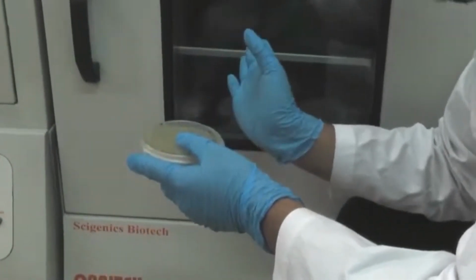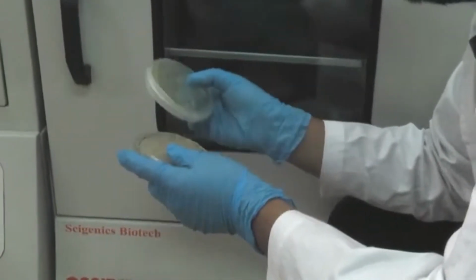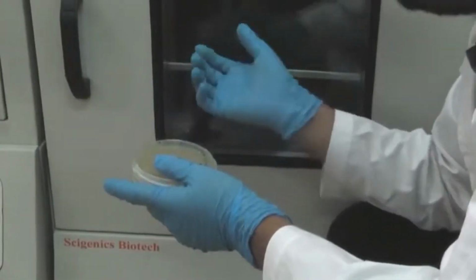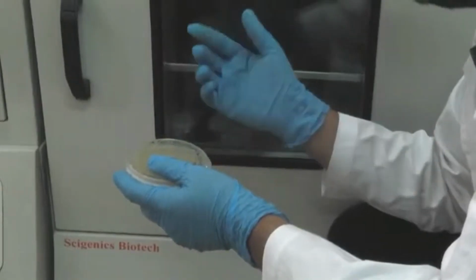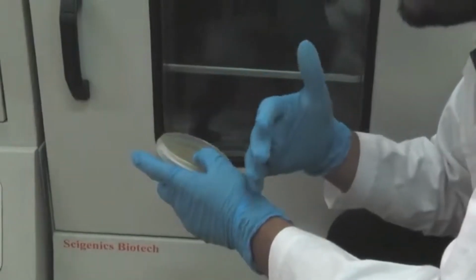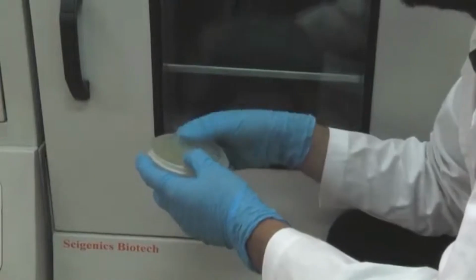Also, once you have kept them in the 37 degree centigrade incubator for sufficient time, and you come in the morning and see that there might be overgrowth or there is enough growth, you can't keep them indefinitely in 37 degree centigrade. Because if you keep them for 2 or 3 days instead of one day, these colonies will keep growing larger, and then they will all merge together to form a lawn, and then you will not be able to collect single colonies.